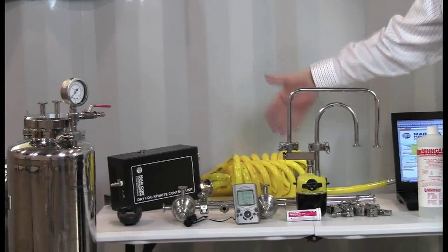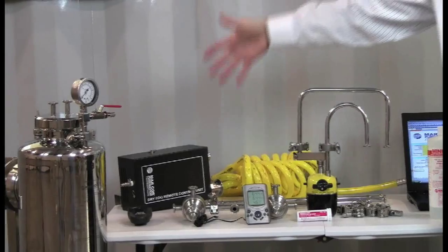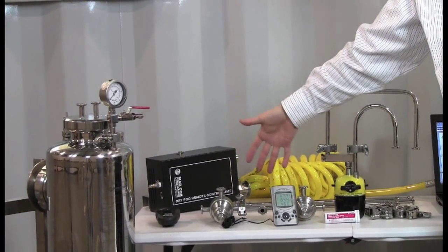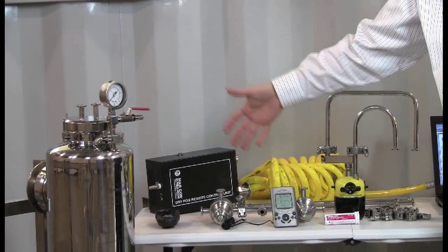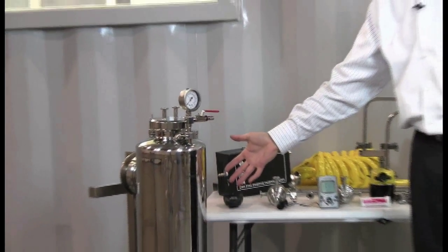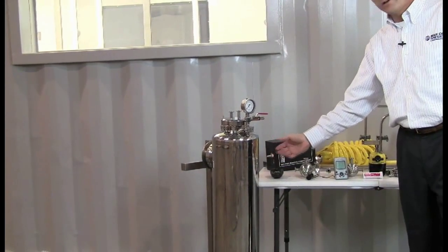Dry fog remote to turn the unit on and off when you're outside the clean room. Compressed air connections, different connections and piping. Regulator to regulate the compressed air to the tank as well as to the head. And the dry fog machine tank itself, which utilizes MinCare, water and compressed air.